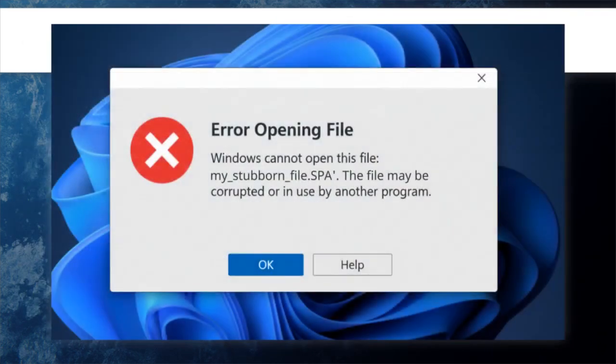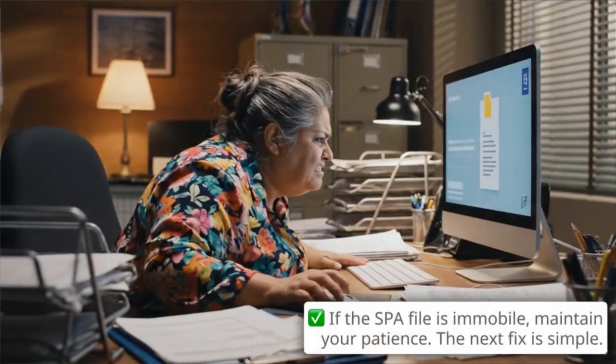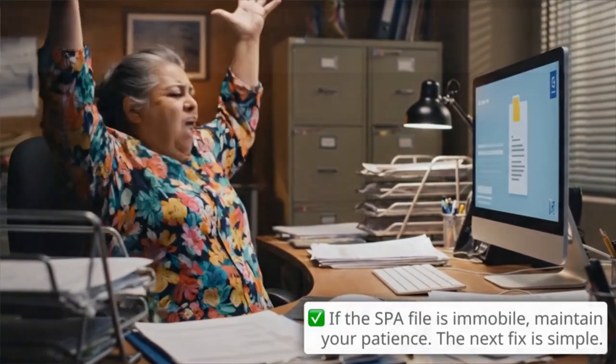If your SPA file isn't cooperating, don't worry. This format is tricky. Since the SPA file is so specific, let's confirm your environment. We need to verify these key details before fixing the error.